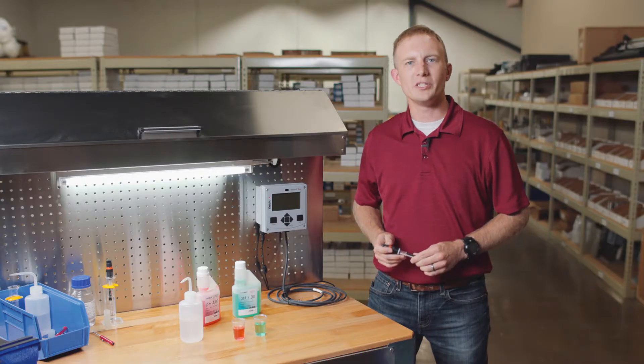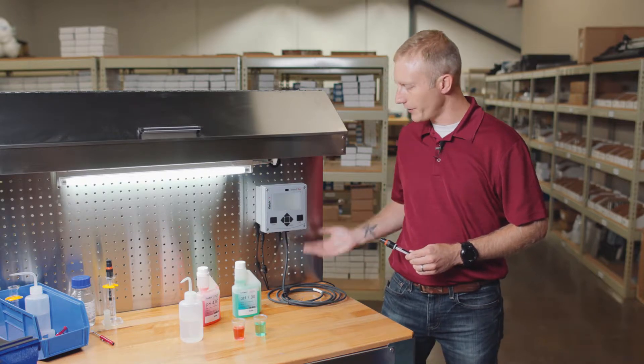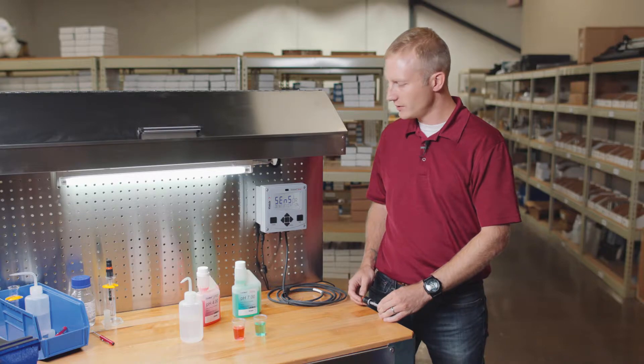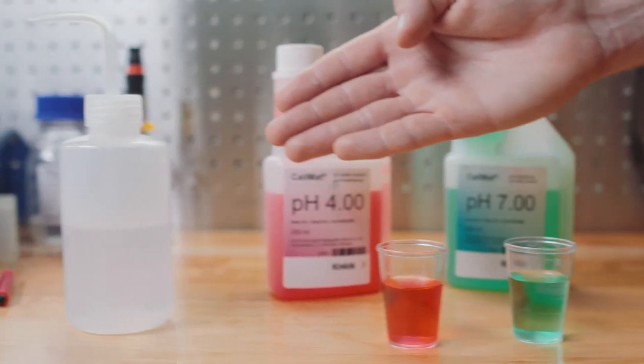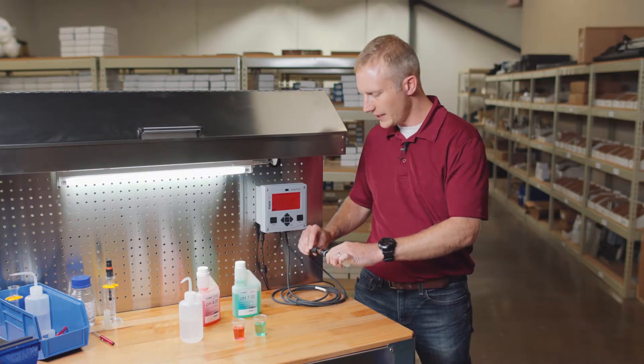To perform a calibration, you will need a Stratasevo transmitter that has been powered up with a MemoSense cable connected, a MemoSense pH sensor, at least two buffers and clean containers to pour them into, cleaning water, and finally a clean cloth to dry the sensor.